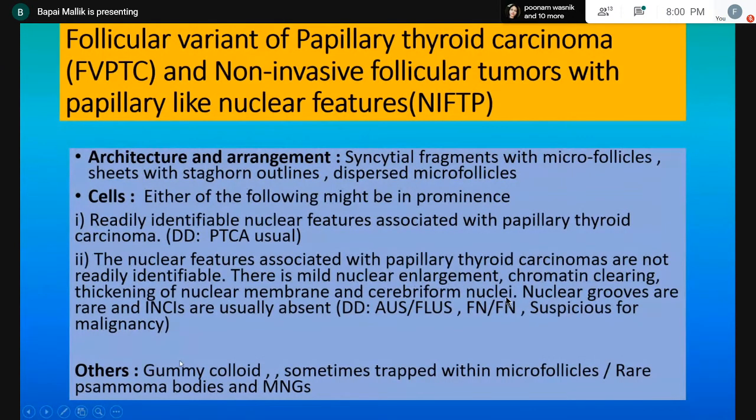The other things which may be found are gummy colloid. Sometimes they may be trapped within microfollicles, and you can sometimes see some psammoma bodies and multinucleated giant cells.